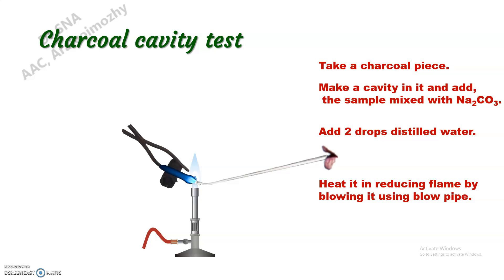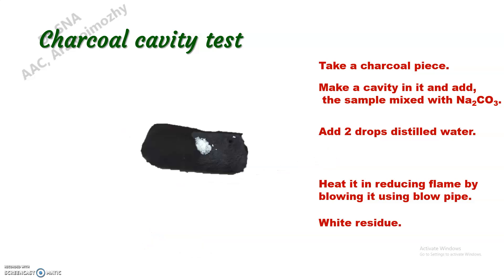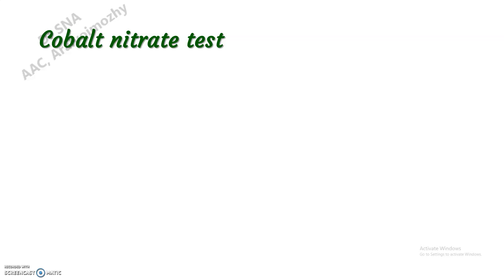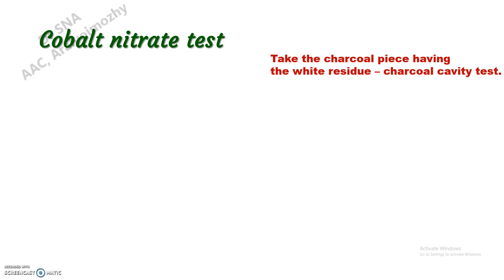Now we can heat it in the reducing flame by blowing it using a blowpipe. After this, we are getting a white residue here. As we are getting a white residue, we can continue to the cobalt nitrate test.